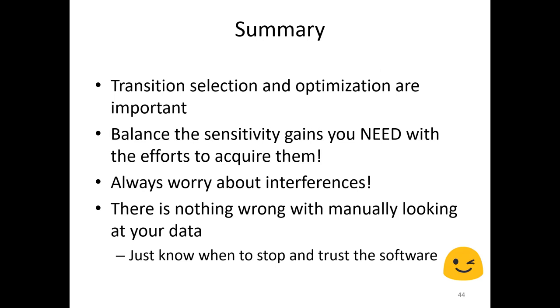All right. Yeah, so transition selection and optimization are important because you want to make sure you're monitoring what you think you're monitoring. There are a lot of things you can do to improve sensitivity, but you have to approach it from a practical standpoint of how much time you want to invest in that, and is it worth the gain in sensitivity. If you're going to spend 3 months trying to optimize and make something more sensitive and it doesn't work, how much did you really want to gain, and was it worth that waste of time?